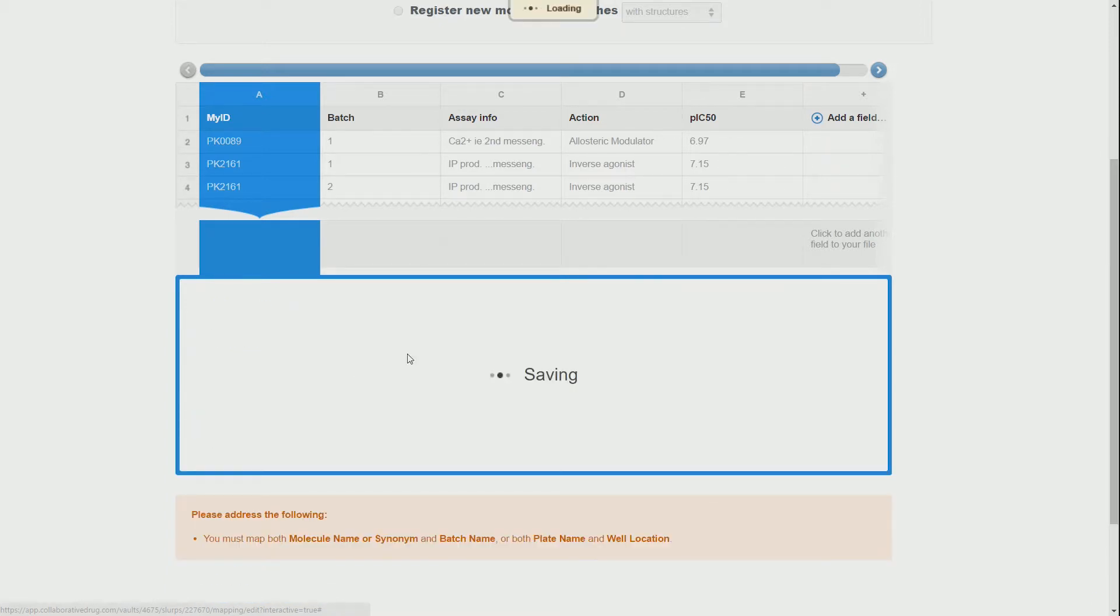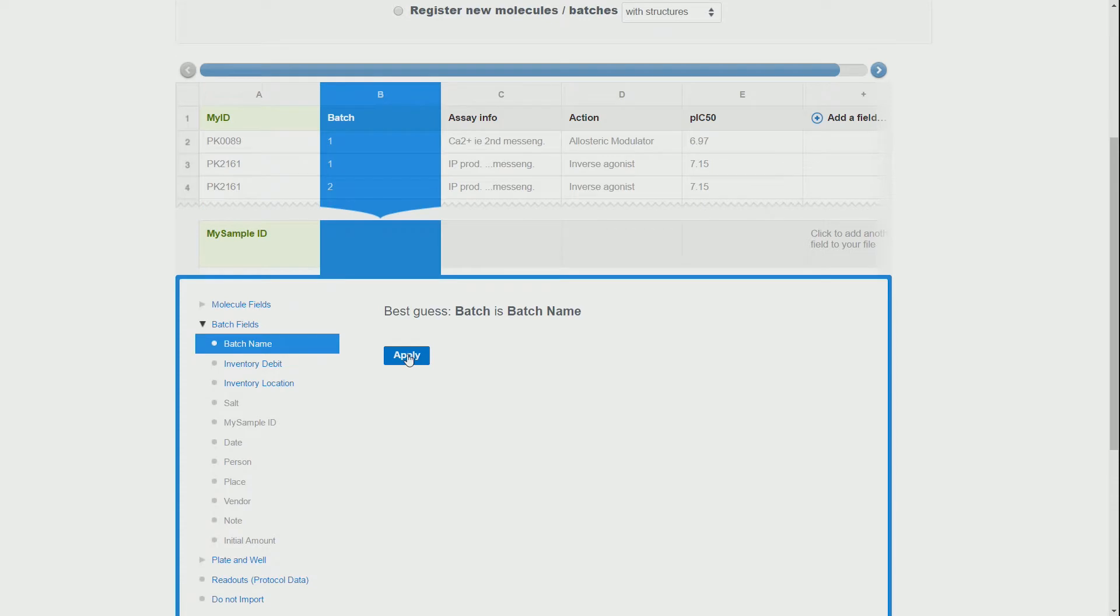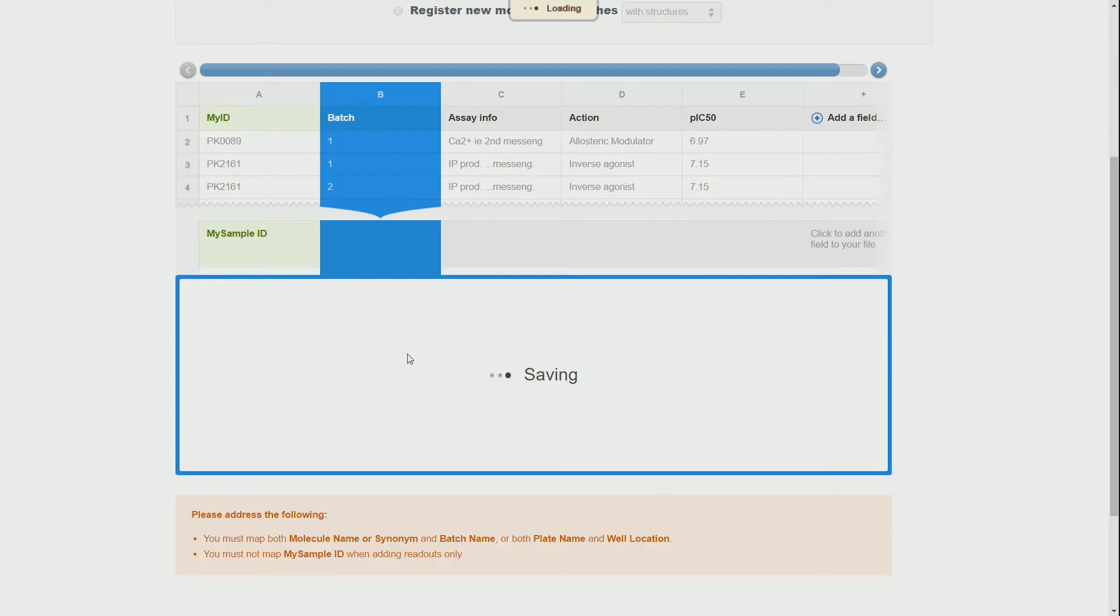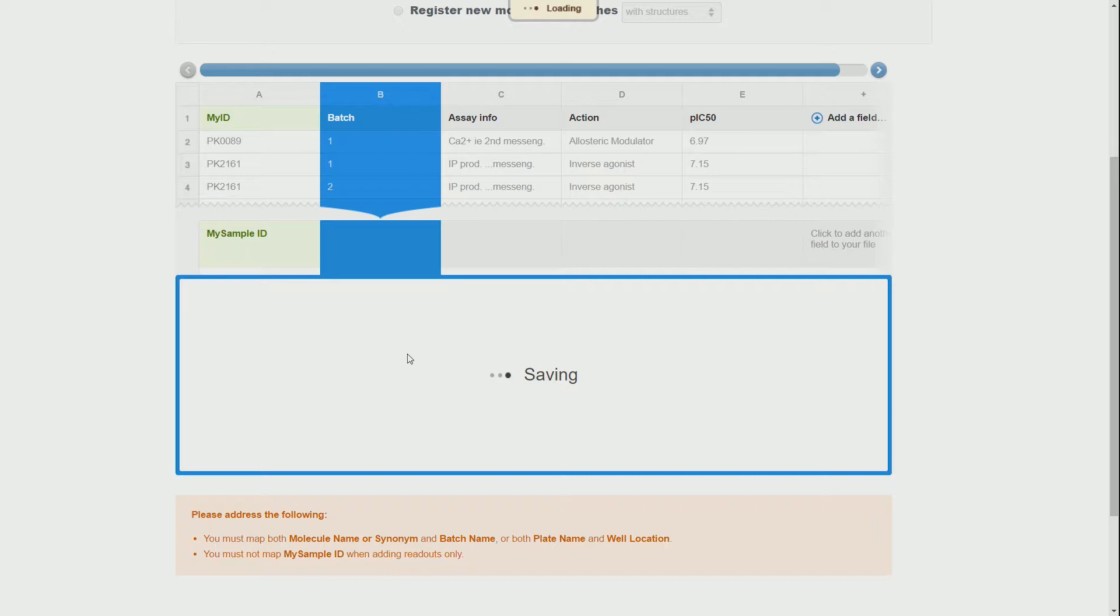We start by assigning the IDs and the batch in this case. As we will see, it is easy to assume that this is the same as the batches that CDD has assigned. In a moment we will see how this will lead to trouble though.